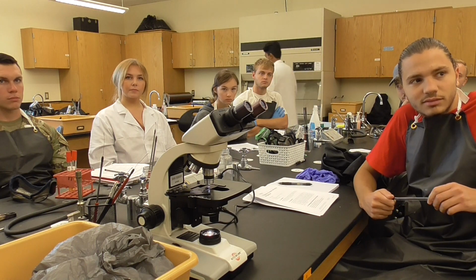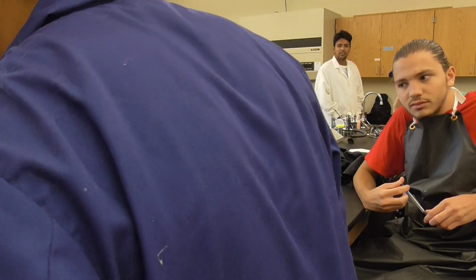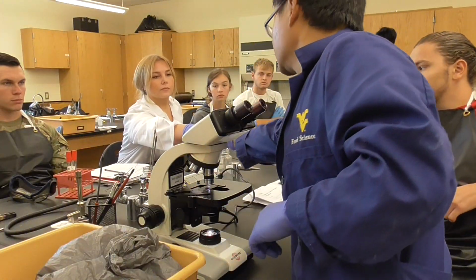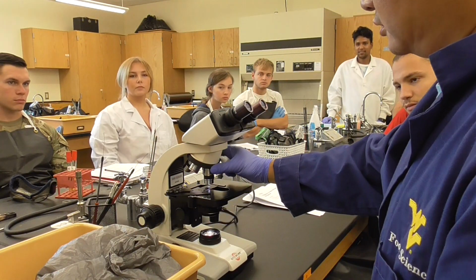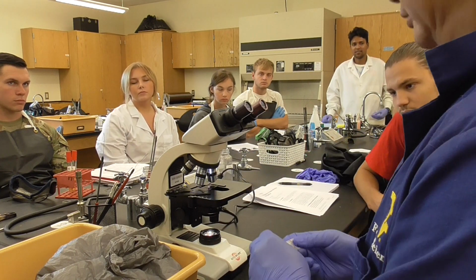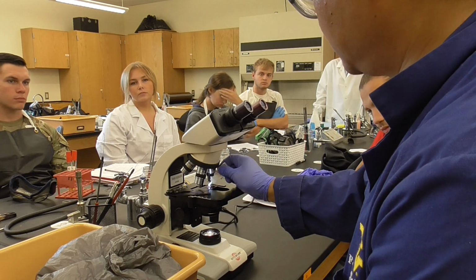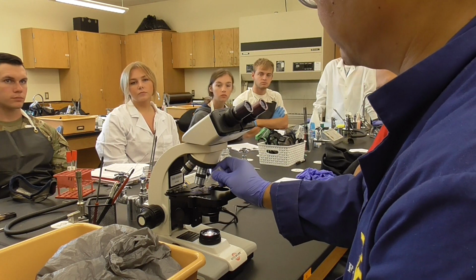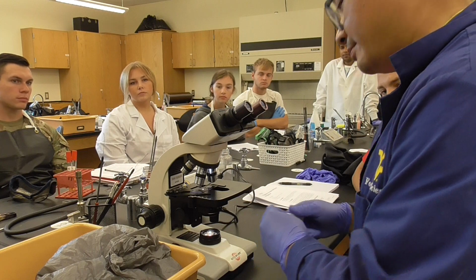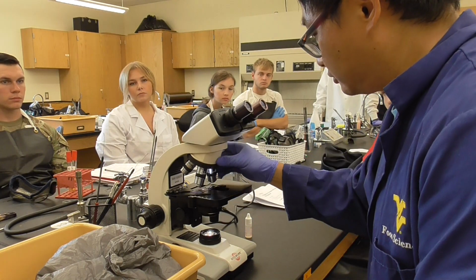Now, what we're going to do is oil immersion. So we're going to find the oil. Where's oil? Okay, good. That's oil. So, click 1, click 2. Is that right? So we're going to put the oil there. One drop of big oil. Huge. And we can put one even in a bacillus area. That maybe need to refocusing. We'll see. But this one, ideally, we shouldn't do it.